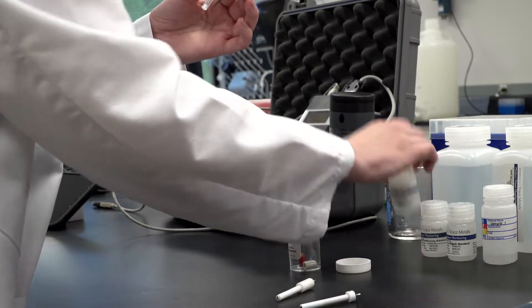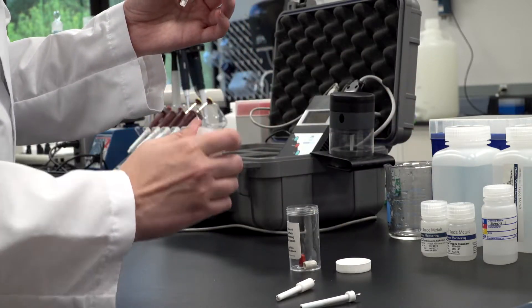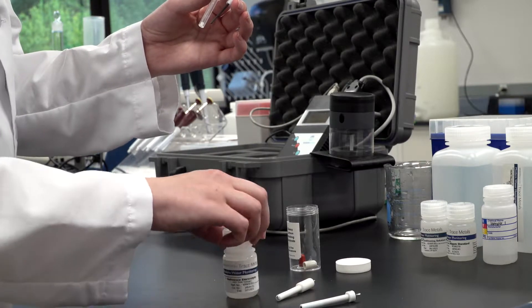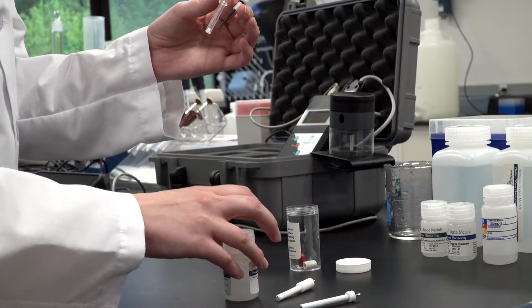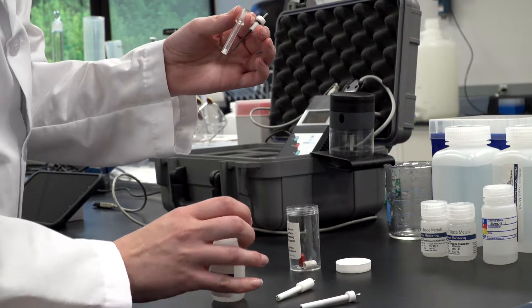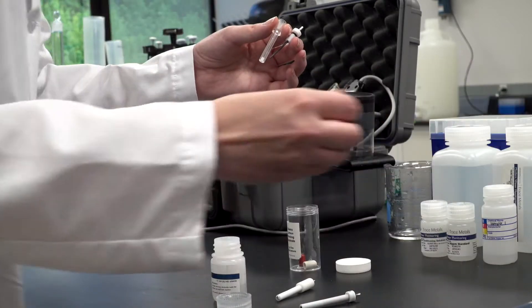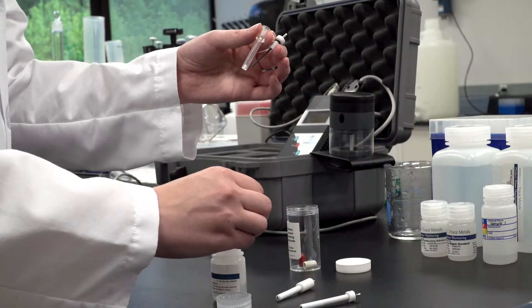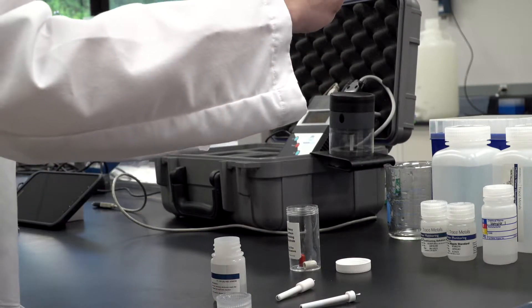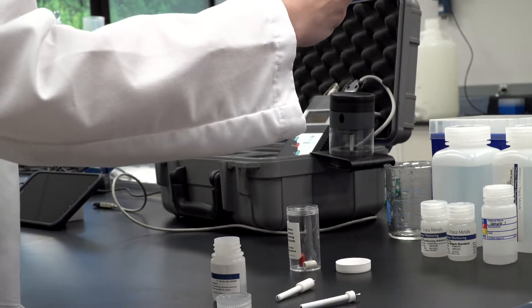Fill the reference electrode sleeve with reference electrolyte, part number 810060, to approximately three-quarters full or the level where the electrode casing sleeve widens. Do not completely fill the electrode sleeve, otherwise the frit may be pushed out due to hydraulic pressure.